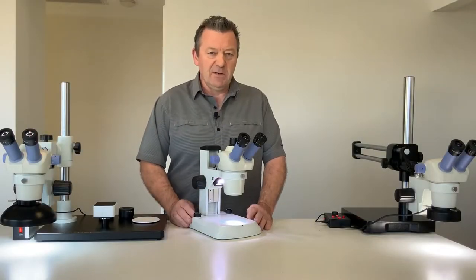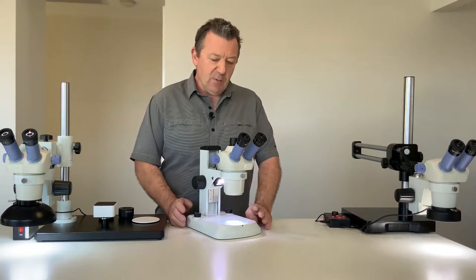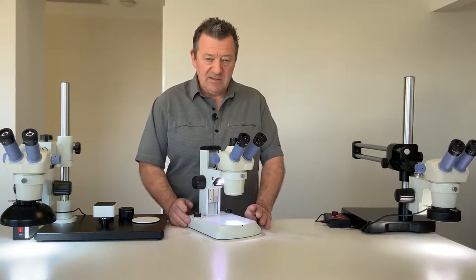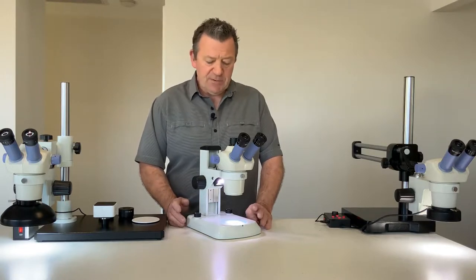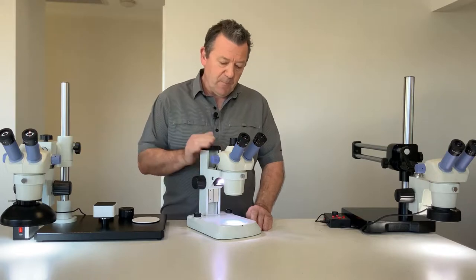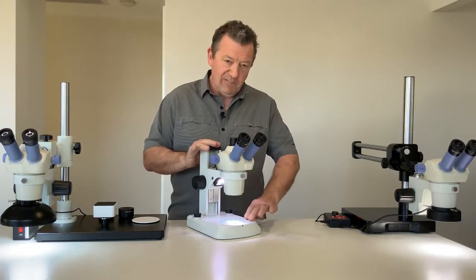Hello, my name is Stephen Wilkinson from microscopes.com.au and today I would like to demonstrate our ASZ400 series stereo zoom microscopes. The basic configuration is our stereo zoom upright microscope.